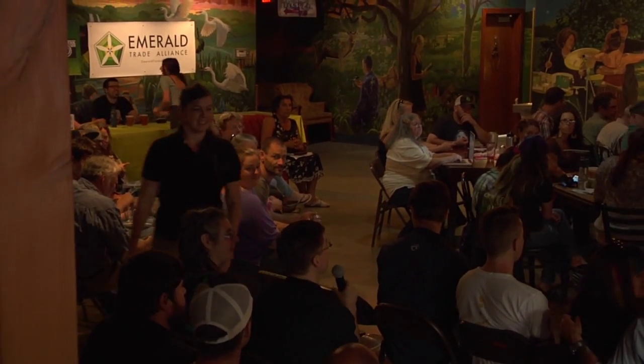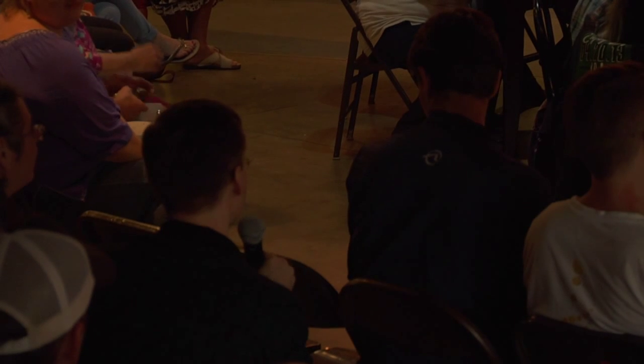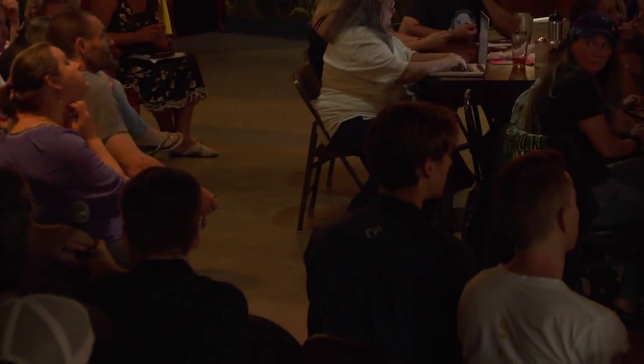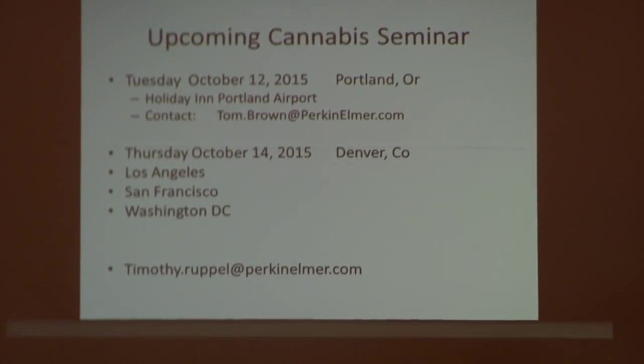Okay, we have one more in the back over here. Hey there, since you're a specialist on the residual solvents, I was just wondering if you happen to know if any of those solvents form azeotropes with compounds in the resin, such that they kind of elute at the same time. We can, yes. Very small concentrations we actually find in the plant material itself.